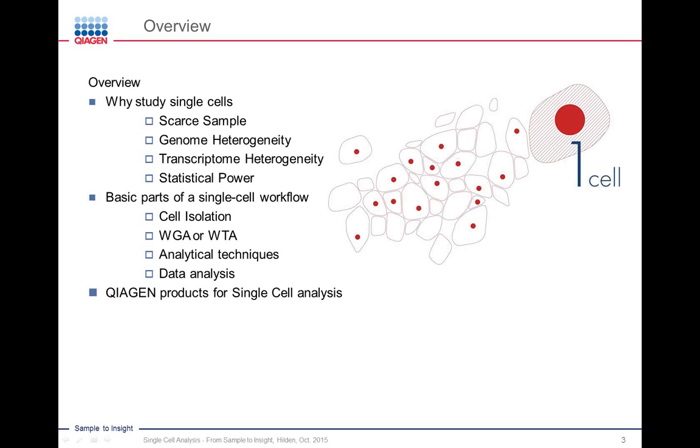These aren't too different from doing a normal bulk sample workflow, with the exception that you need somehow to go from a bulk sample down to a single cell. And there are a few methods to do that. I'll touch on those briefly.